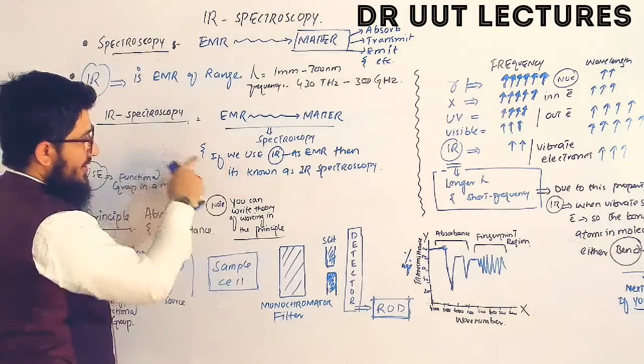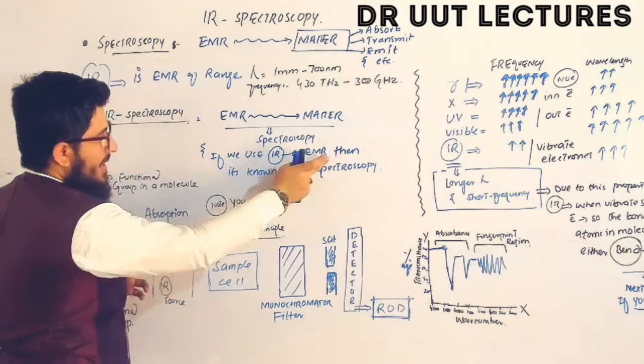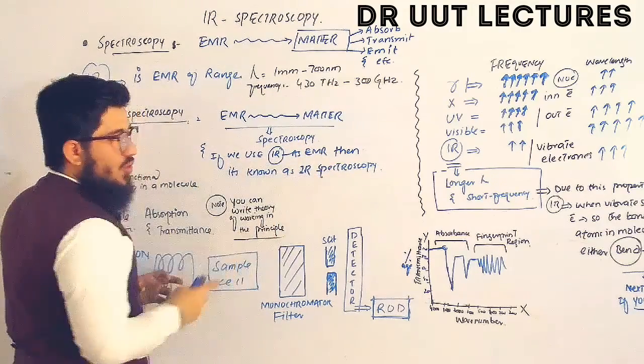So again, I have written these words here. If we use IR as the EMR, then it is known as IR spectroscopy.